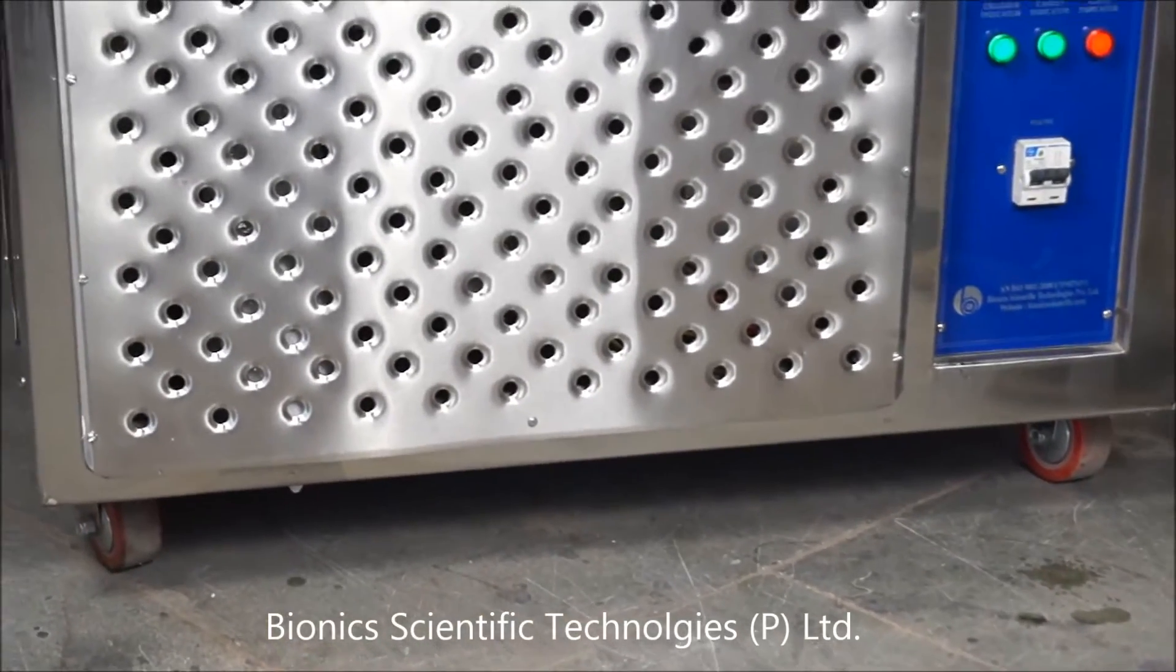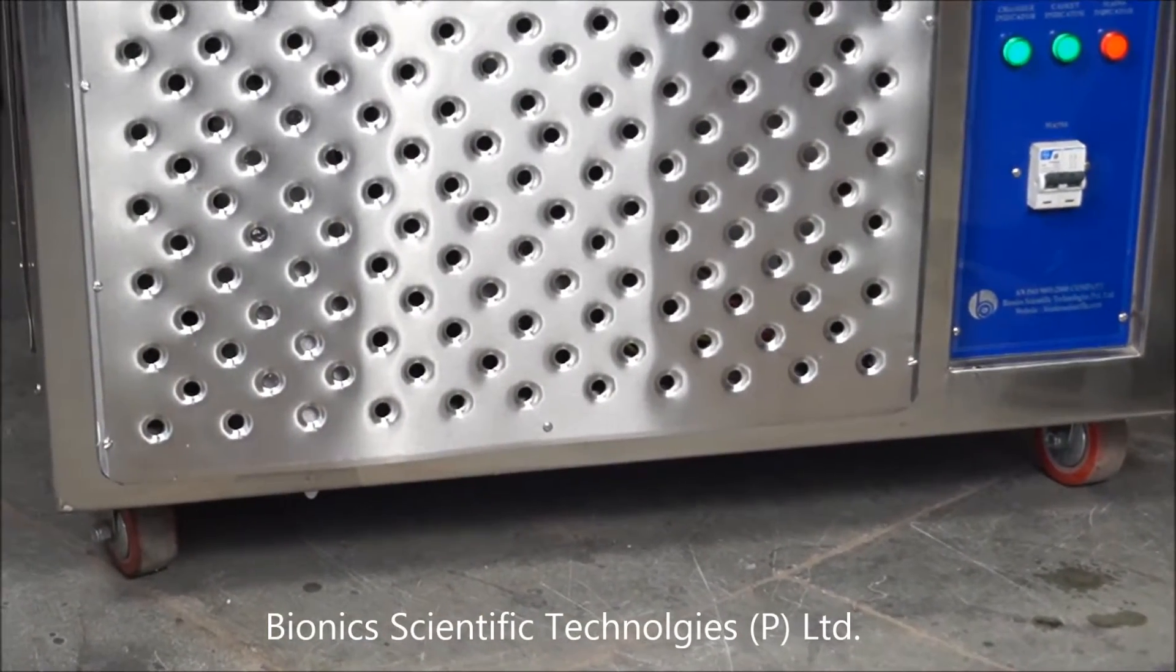This deep freezer has wheels which help to move it from one place to another.